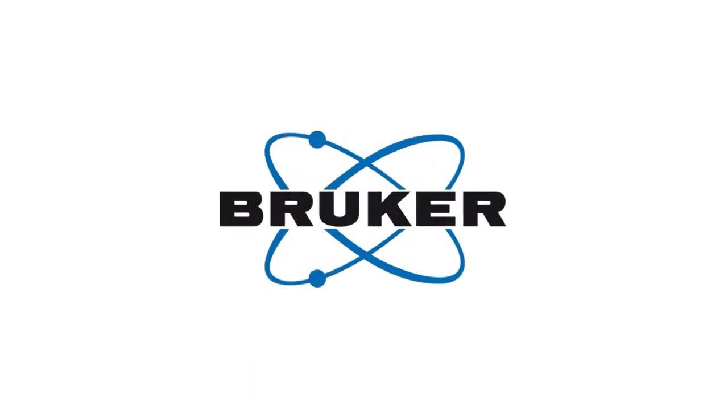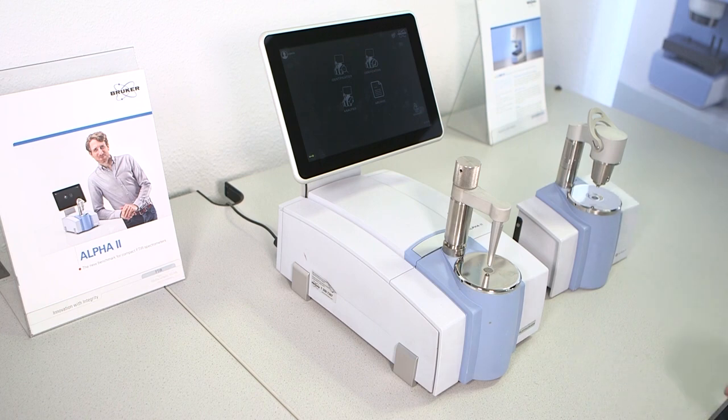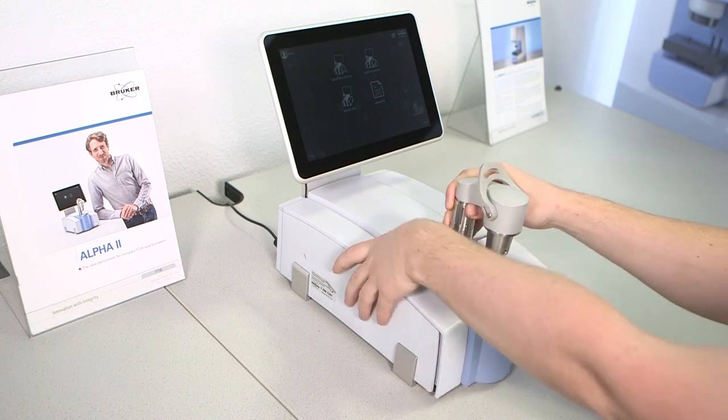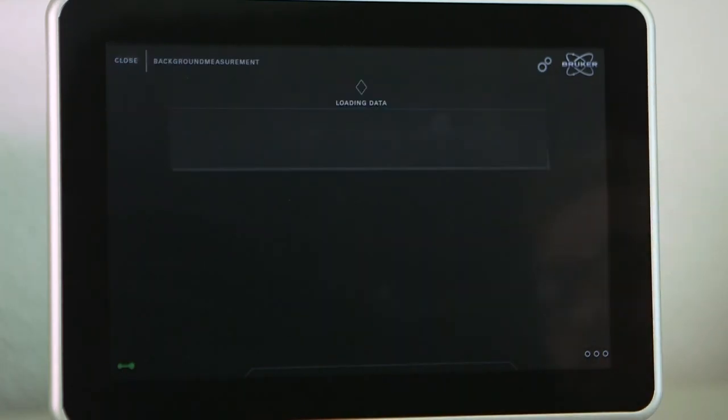This video is about the reliable verification of known materials. FTIR is suitable for a wide range of sample types. For an easier handling of liquid samples, we now use an FTIR unit with a sample trough. The start of any FTIR analysis is a background measurement.